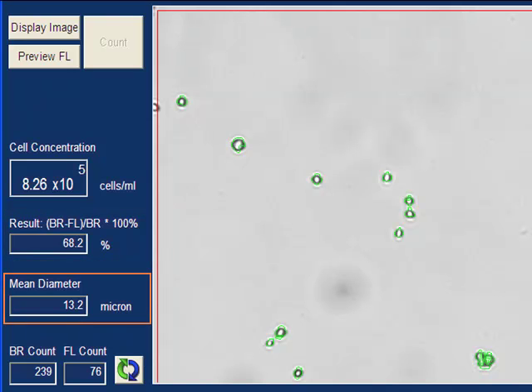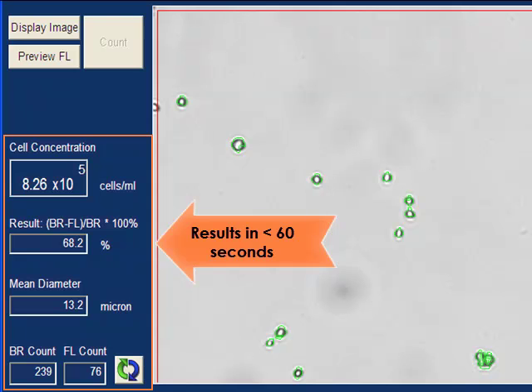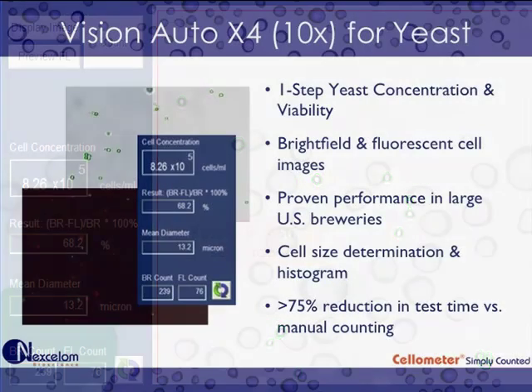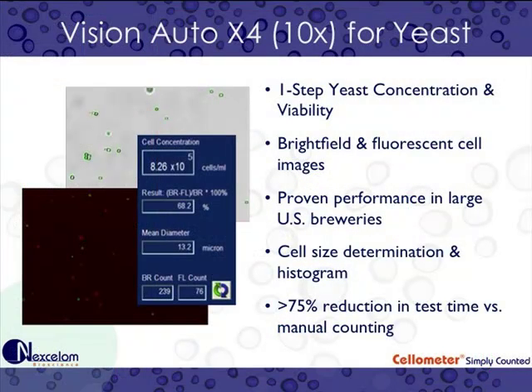Imaging and calculations are completed in less than 60 seconds for each sample. The yeast images and results table can be exported for data archiving or presentation.